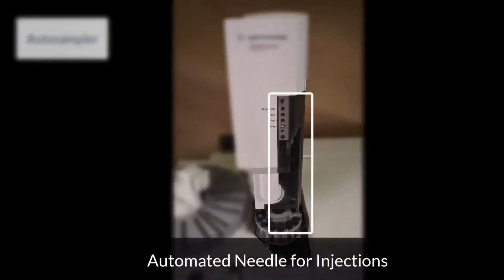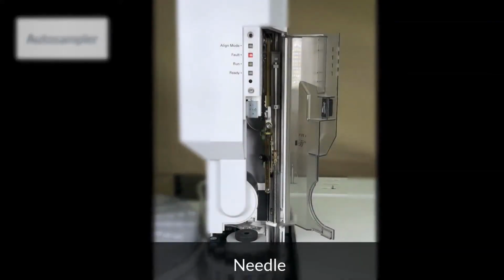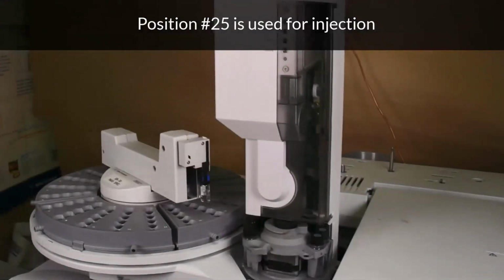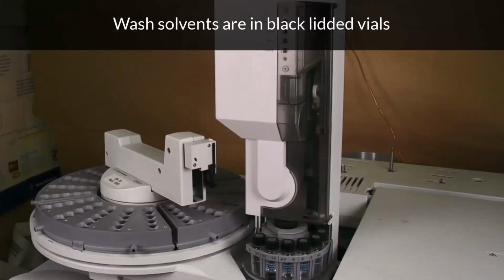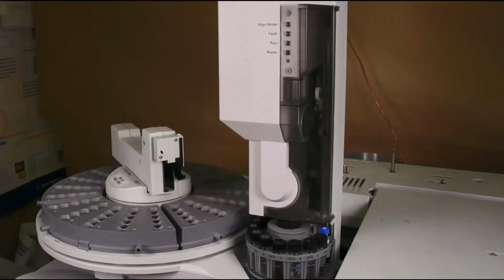This is the injection needle. It is programmed to rinse the needle between sample injections. For how to do manual injection, check out this link. The autosampler selects a vial and positions it under the injection needle. The autosampler proceeds with washing stages before it injects the sample. The needle withdraws sample at set volumes for injection.